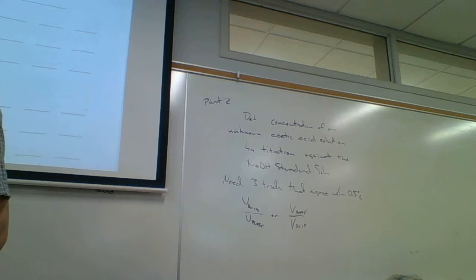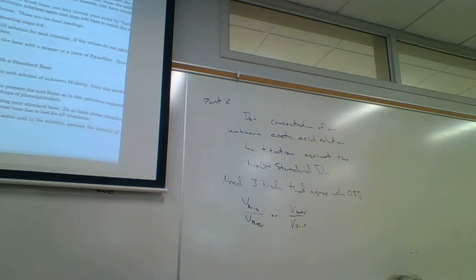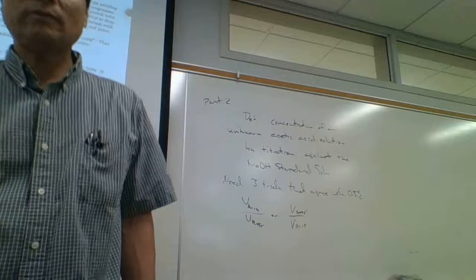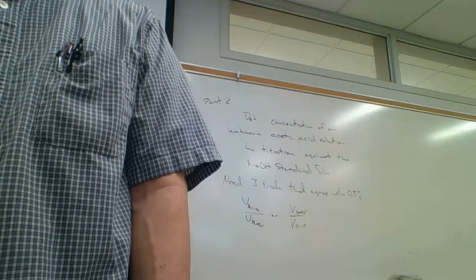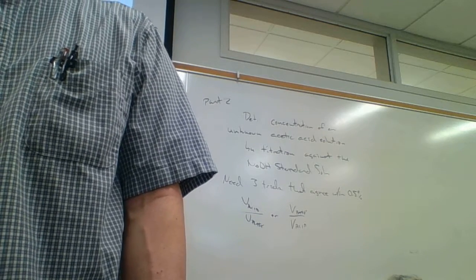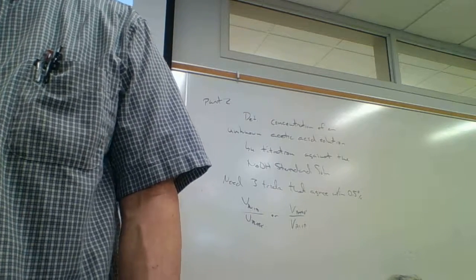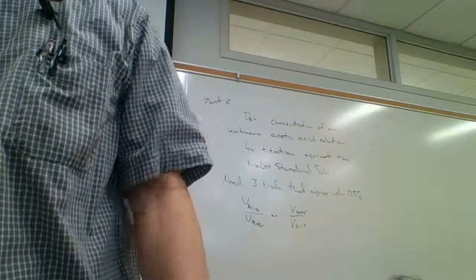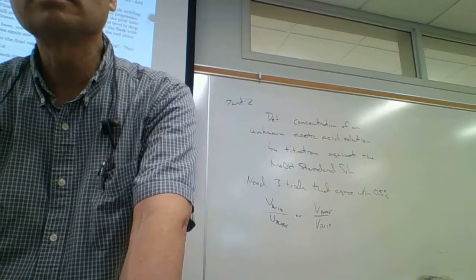And then you'll get approximately 100 milliliters. And so with the stockroom, what happened this morning is they want you to get the burette and the burette clamp first, and then go back a second time with the beaker for your unknown acid. Okay, so first time just grab the burette and the burette clamp. Second time bring a beaker. Okay? Otherwise, that's $400 worth of burette, and so they don't want you to break it by accident. Okay? All right, I'm going to stop here if there are no questions, and we'll just get started.